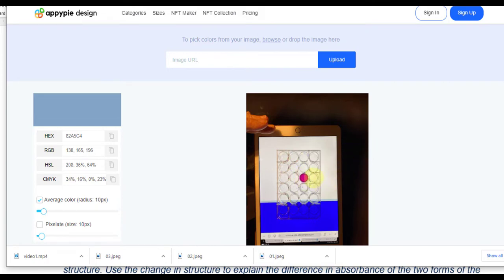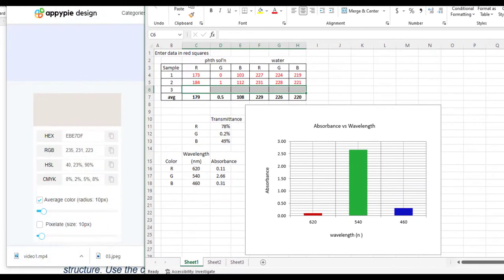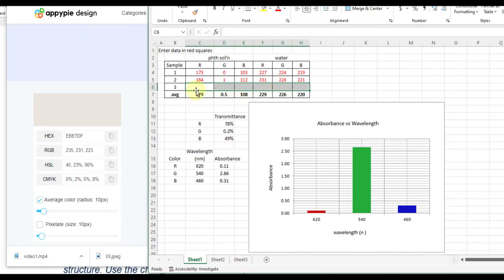I'm going to look and see what colors manage to get through. The maximum that can get through is 255. That's the way they run colors on digital systems. And here you can see the red, green, and blue components of this white background. This is where I took this picture, and that's what we have there. I have a spreadsheet. I'll pull that up, and I'm going to record that data. I'm going to move this across. I'm going to put that in trial 3.